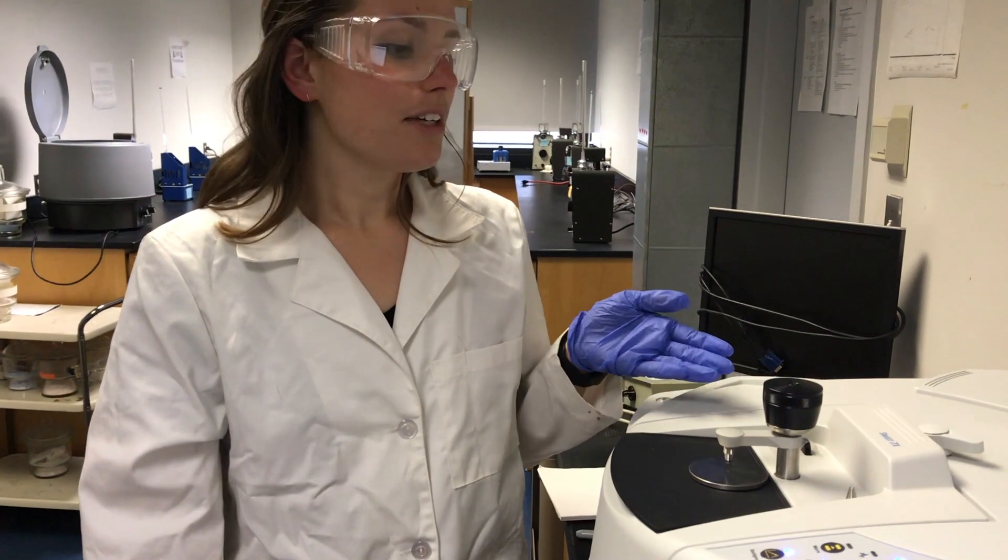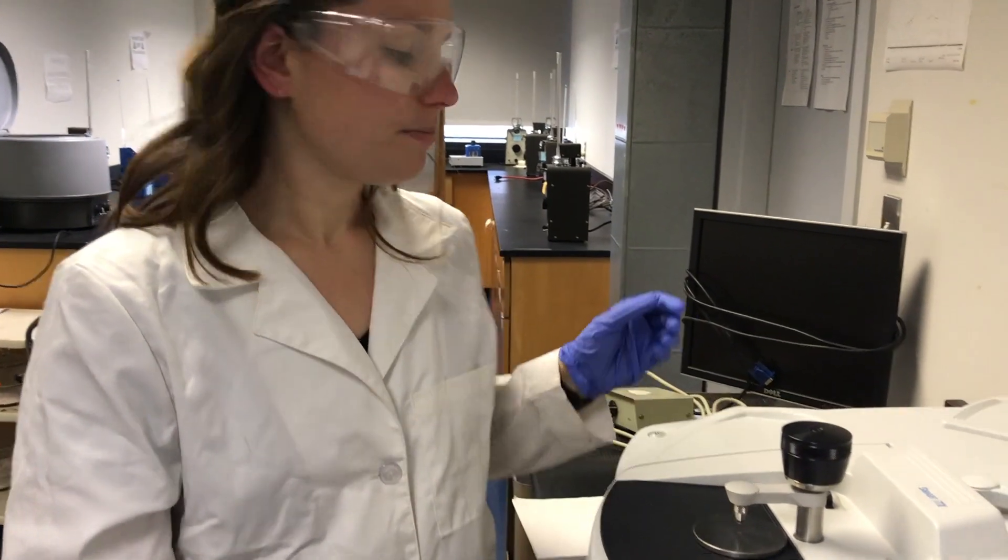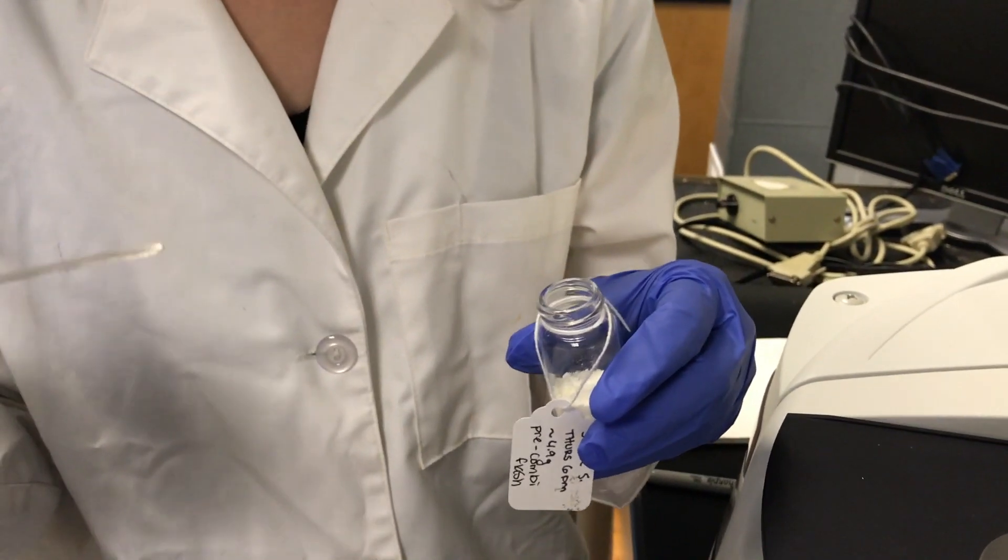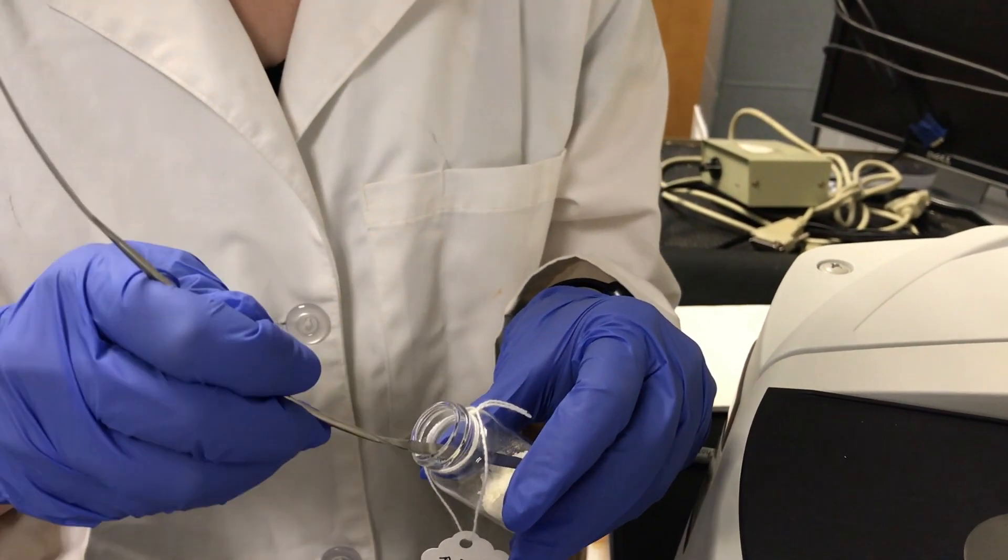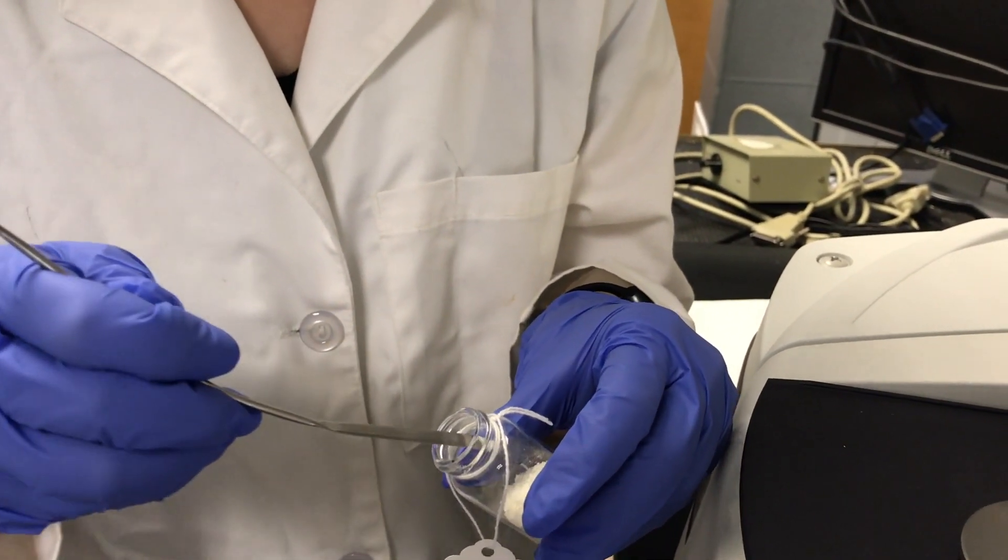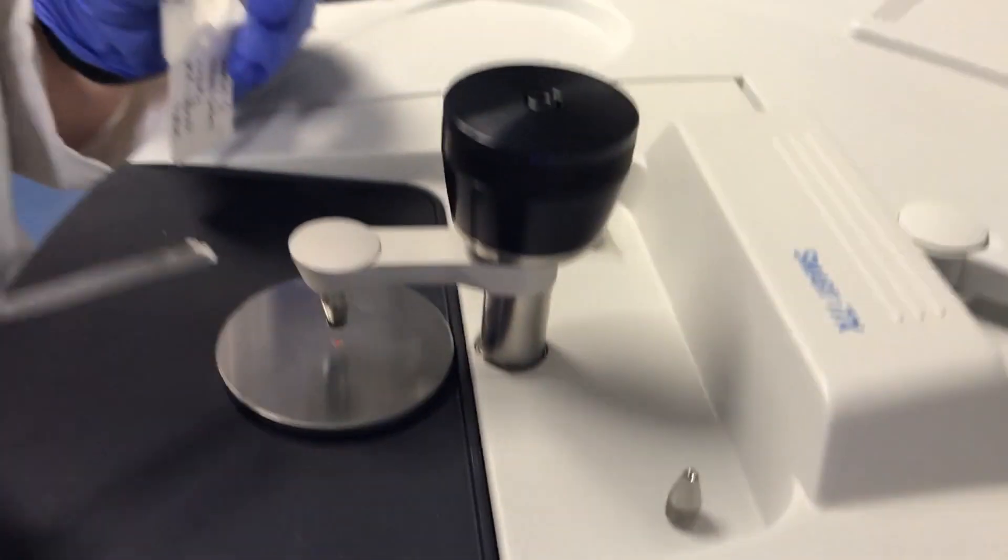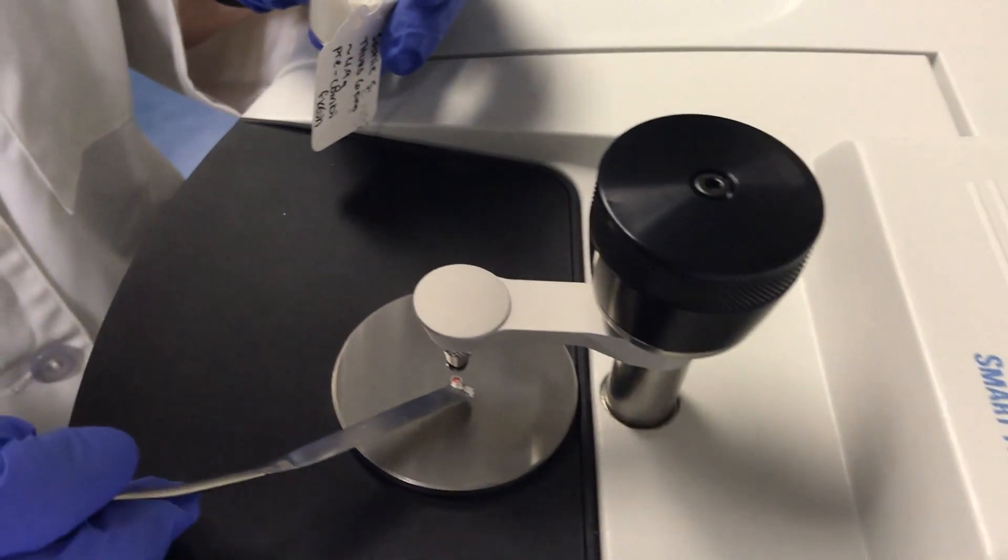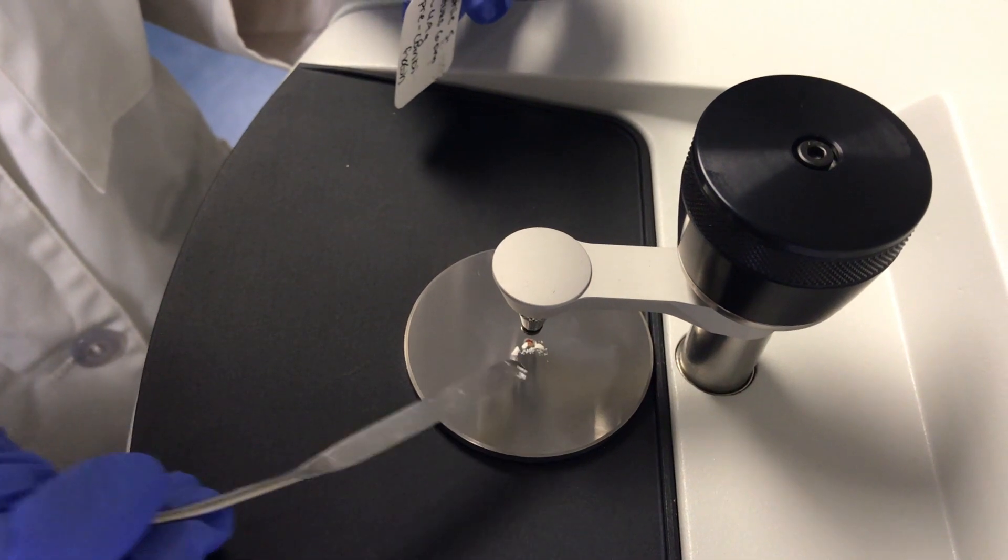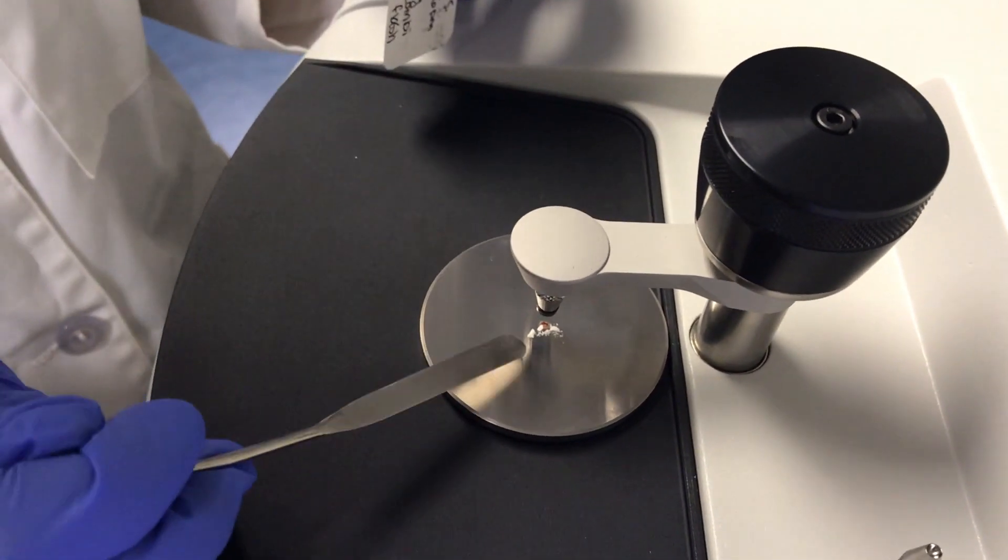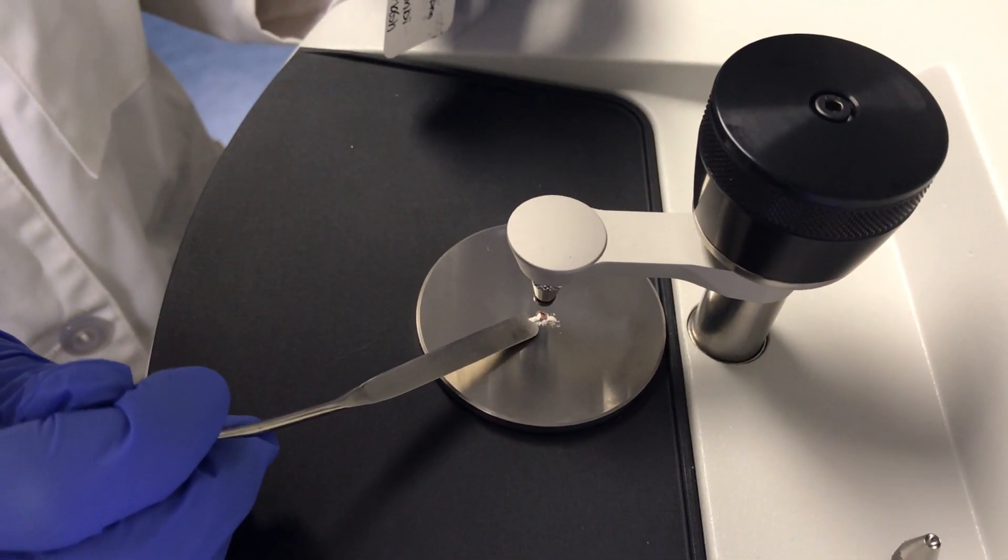Now that you've run your background, you can load your sample onto the crystal. Using the spatula, you're going to want to take a very small amount of the sample. Try to get it as close to the crystal as possible, but if you miss that's okay because you can always move it with the spatula.